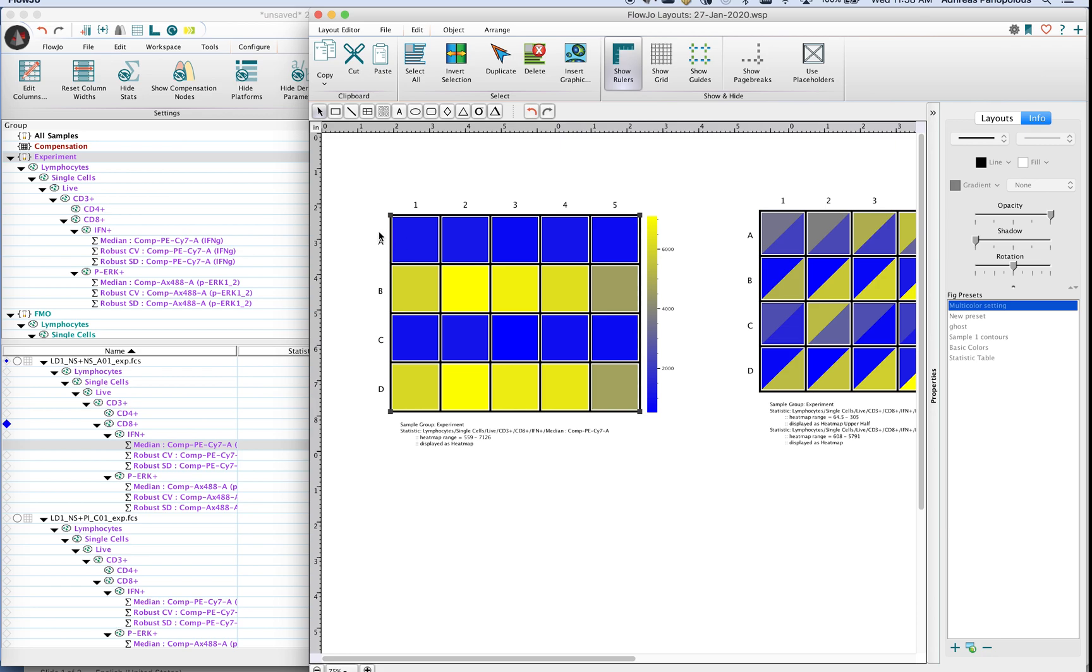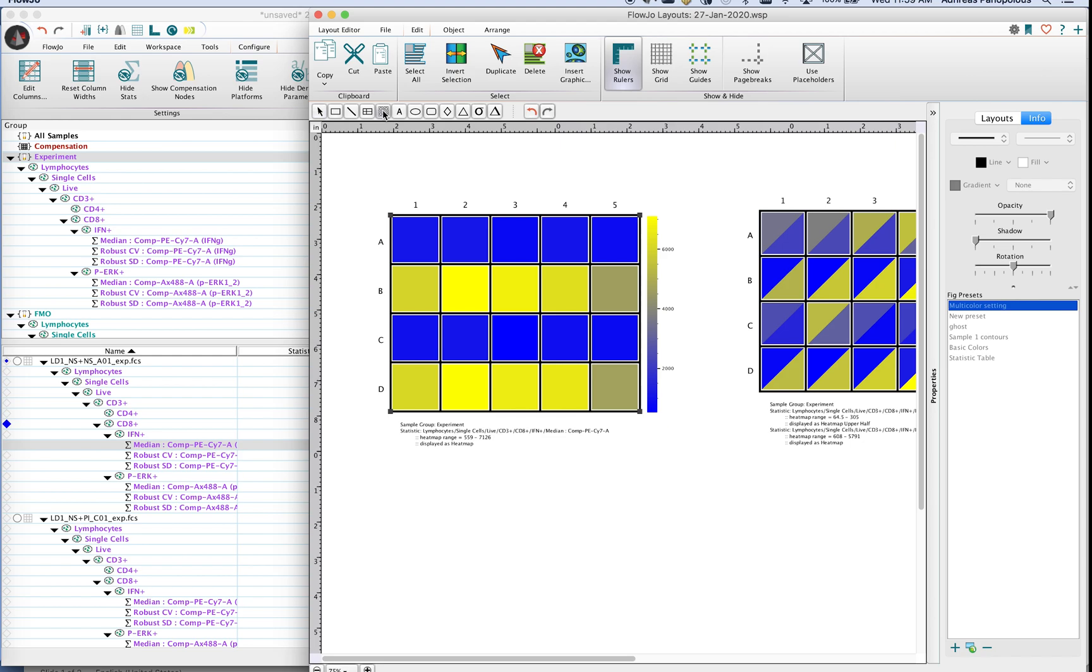Row A in my case happened to be my non-stimulated sample. Row C is a later stimulation around 20 minutes and then row B and D represent my one hour and two hour stimulation. So I can clearly see that in the one hour time slot and the two hour time slot I certainly have up regulation of interferon. And I can contrast this to some of my other statistics or other populations.